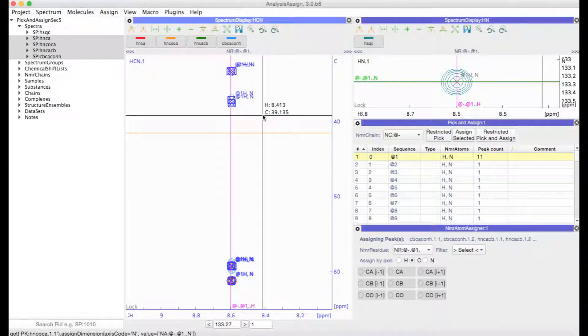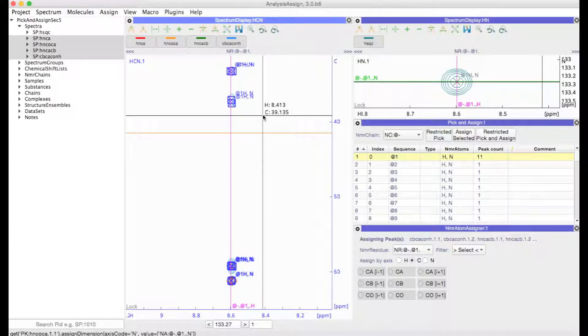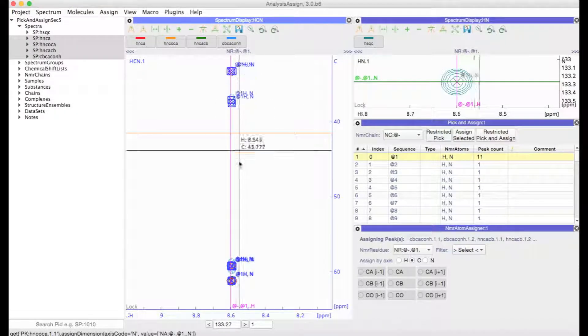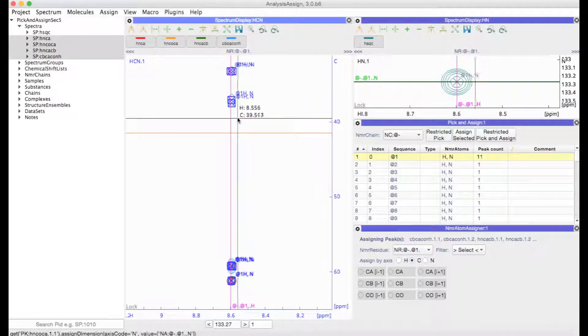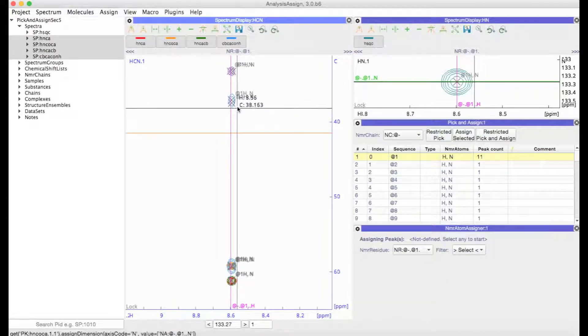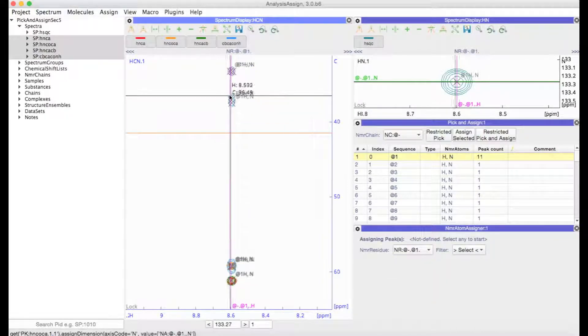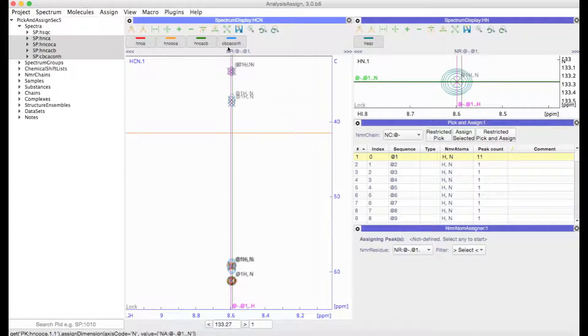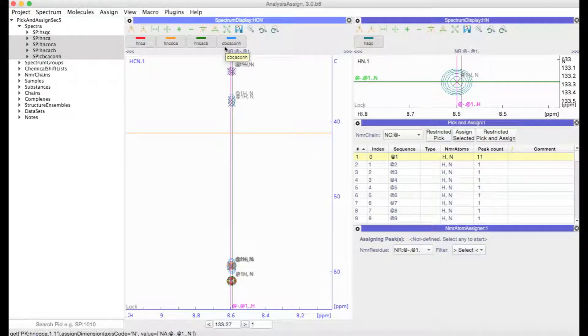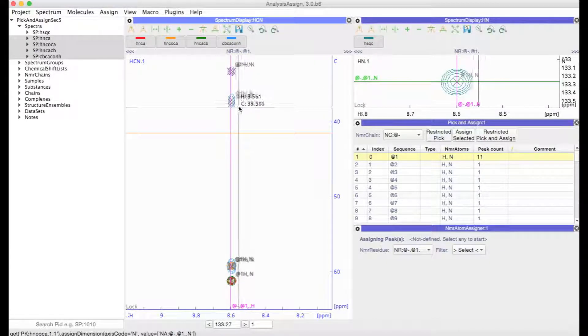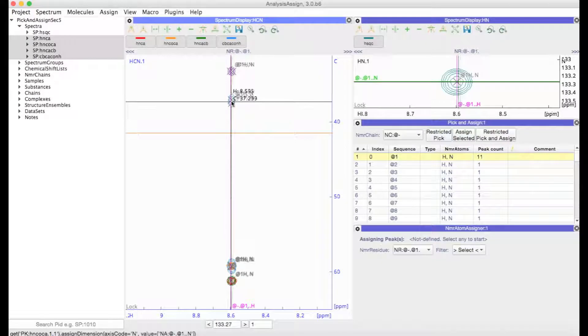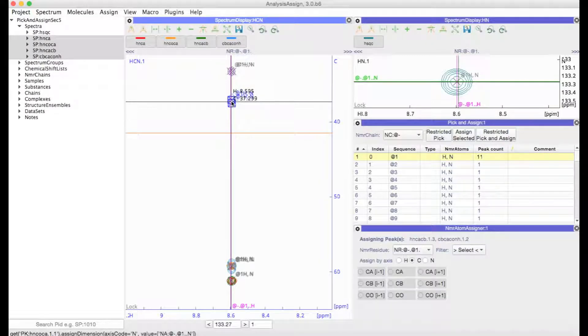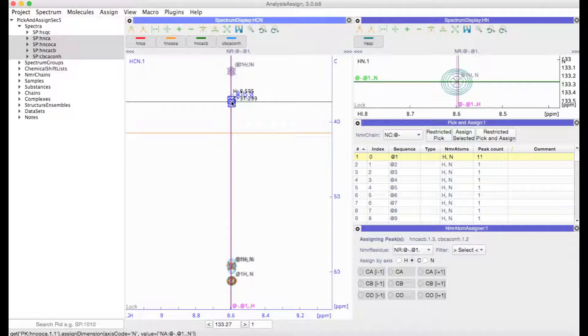And then finally we need to create NMR Atoms for the carbon dimension of these peaks. Now my blue spectrum you can see up here is the CbCaCoNH. So based on the chemical shifts and the type of spectrum, I know that these peaks must belong to the CbA atom of the residue previous to the At1 residue.